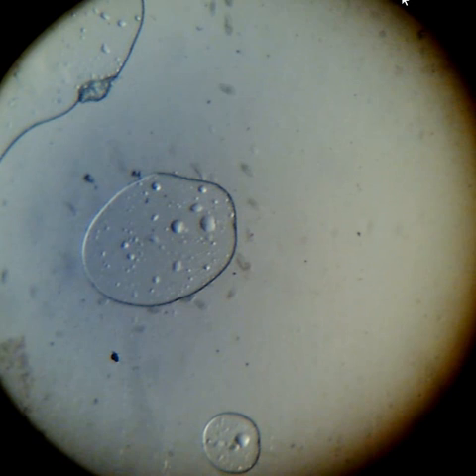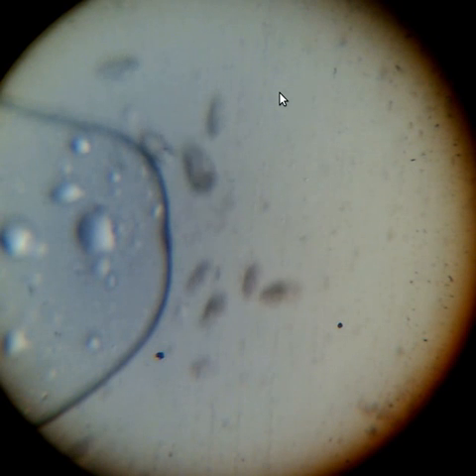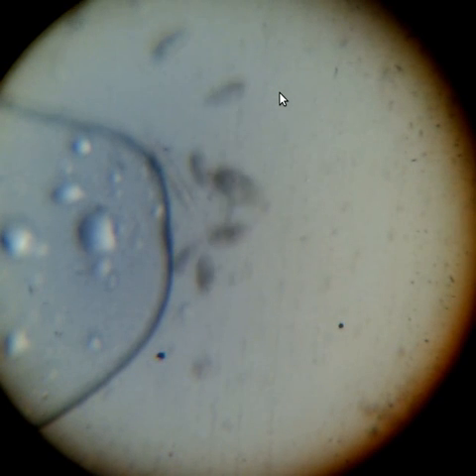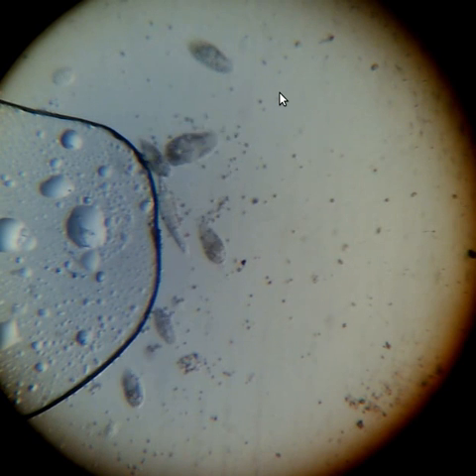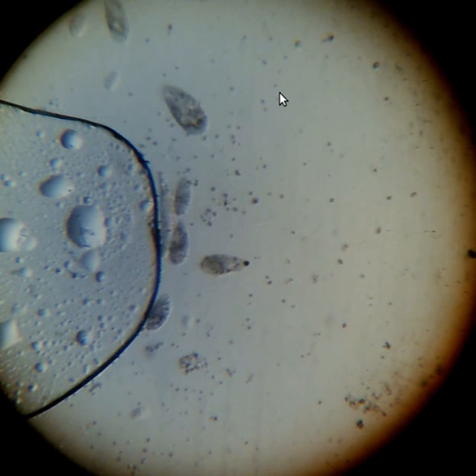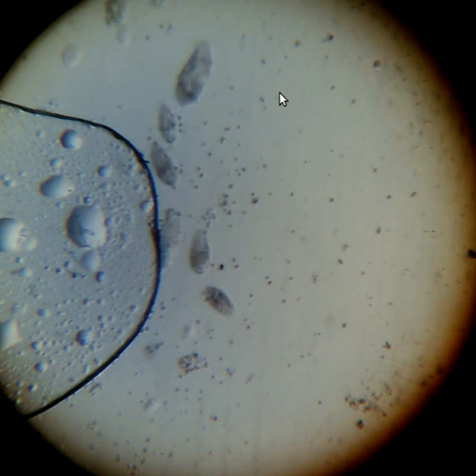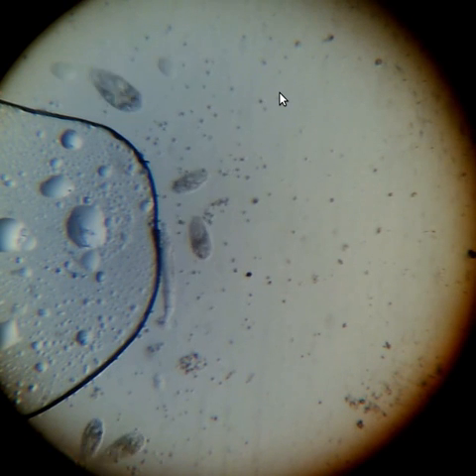I believe it's a protozoa, or it could be some very small flatworm. Now we're zooming up to 100x. We just wait a minute for the light to clear up a little. Sometimes rotifers move like that, but I think that must be some sort of worm. So this is 100x.